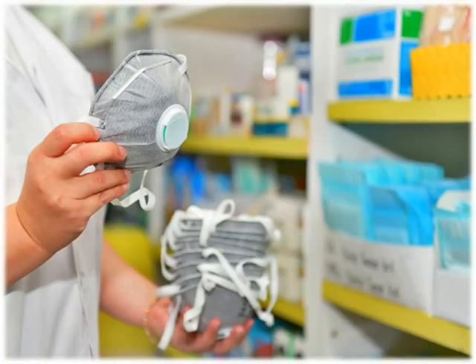In certain situations, N95 respirators can be reused. Reuse refers to the practice of using the same respirator multiple times during a work shift or for the entire shift. The respirator is stored between uses and put on again prior to the next potential exposure. Respirators should only be reused by the same wearer and should be stored according to manufacturer's recommendations and in a way that protects it from damage or contamination.